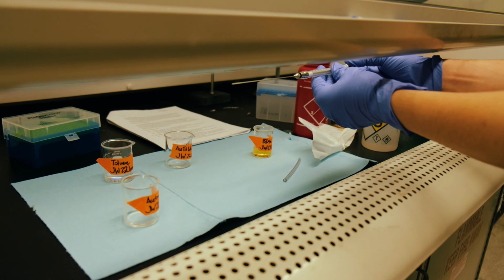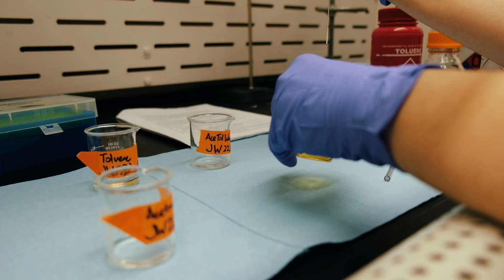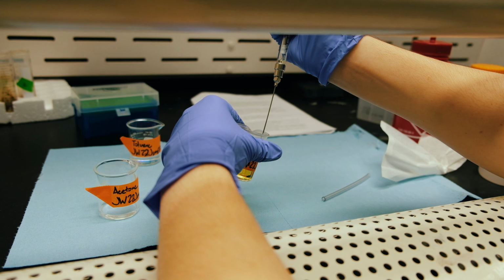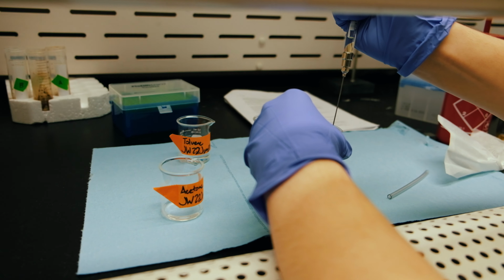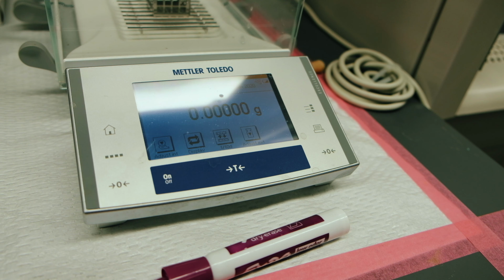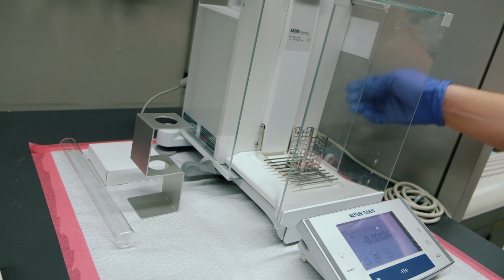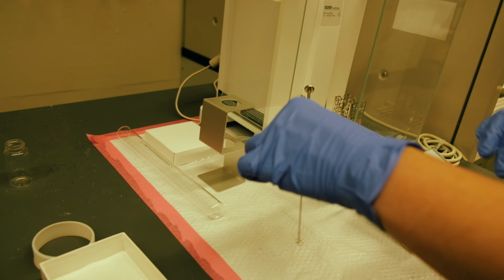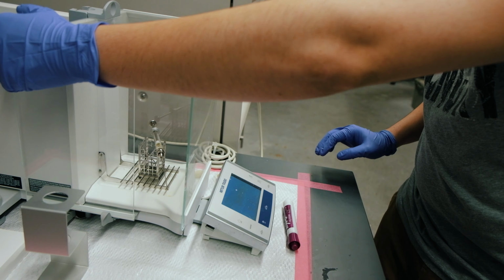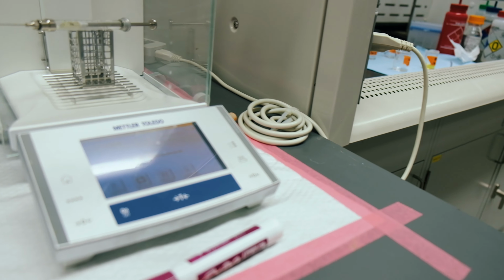Okay, so the SOP calls for 300 microliters of biodiesel, and we're only going to be injecting 200, but the purpose of this is so that we can get a mass differential. We're going to be drawing in 300 and weighing it on the scale over here. So here we're going to want to zero this real quick. These panels on the side just slide open on all sides. We're going to leave this right one and the top one closed though, and stick this inside and close this as much as it'll go. And from there you will tare it and let it do its thing.